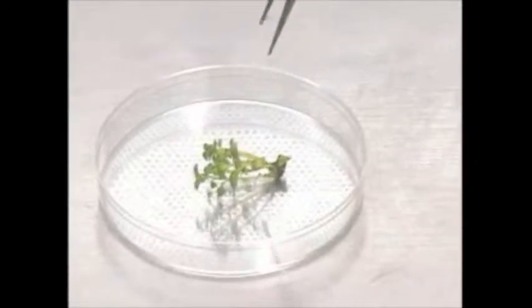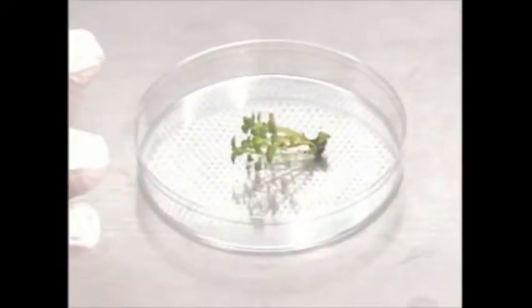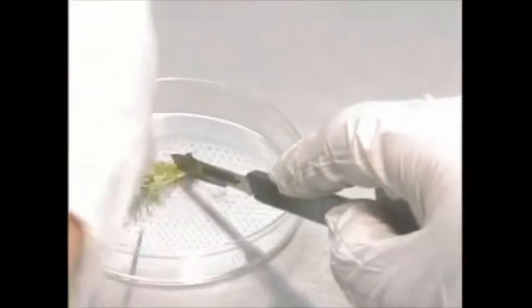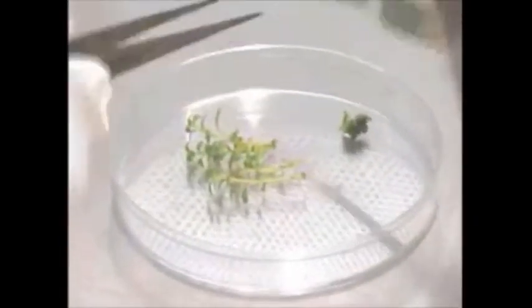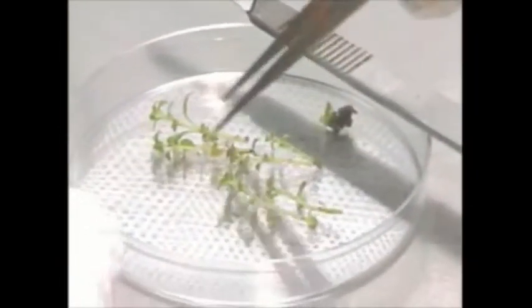Lay it on the surface of a sterile petri dish. Sterilize the scalpel. And use that to cut away the callus. And basically divide that clump into a number of individual shoots.